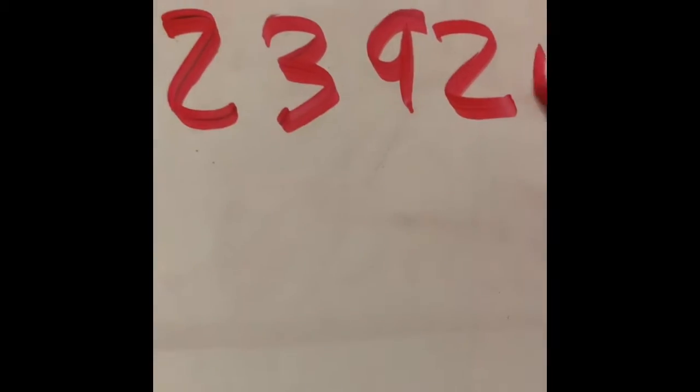Next, we're going to calculate the average citric acid concentration from the 3 exact titrations that were calculated. So the concentration calculations above, and the concentrations of the second and third titrations will be added together and divided by 3 to find the average concentration. So first we had the concentration of 0.2392. That was from the first exact titration.